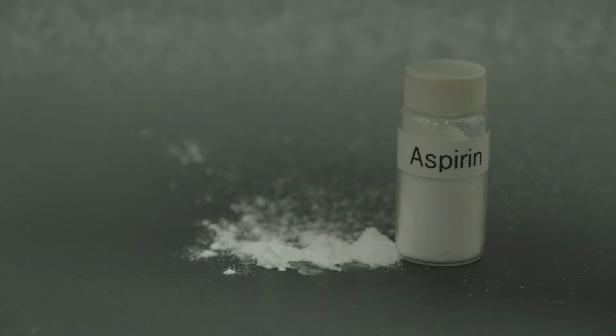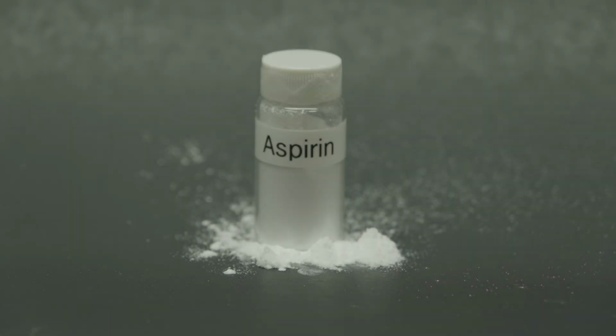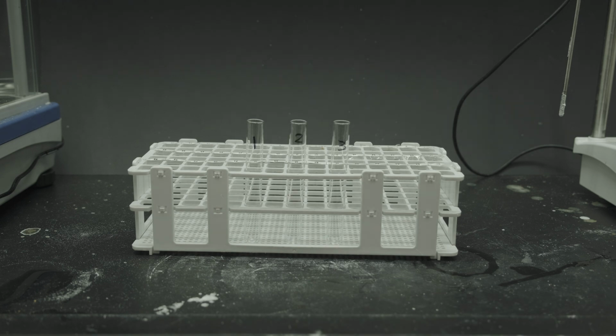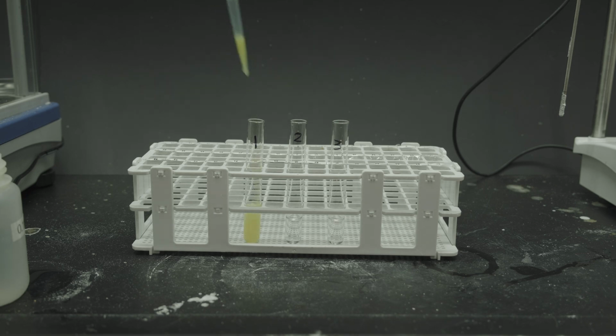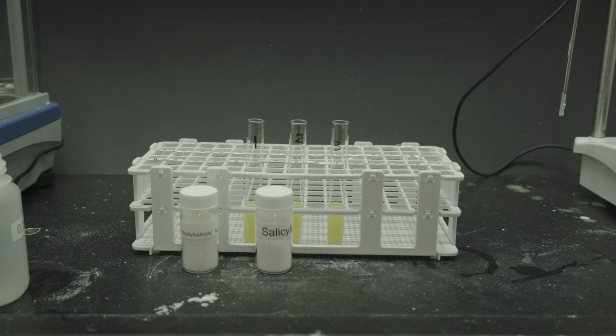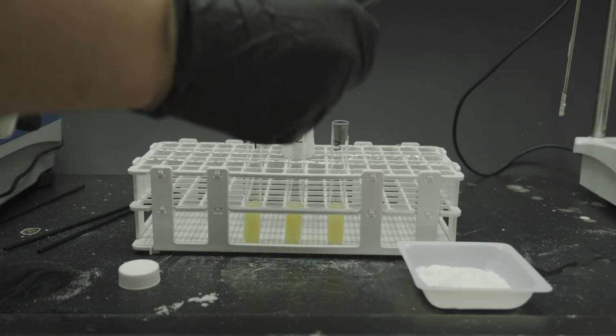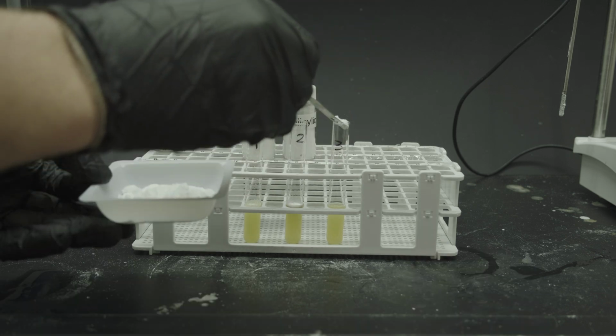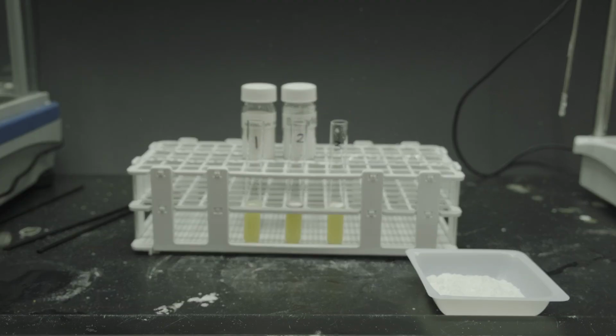So instead of just doing a melting point test, I wanted to be extra certain that what I had here was really aspirin. So I decided to use another kind of test that's qualitative. I got 3 test tubes and filled each one with 2 milliliters of 0.1 molar nitric acid, followed by 1 milliliter of 0.2 molar ferric nitrate. I then assigned each test tube a sample. 1 and 2 were both standards. 1 was aspirin, 2 was salicylic acid, and 3 was whatever I made.